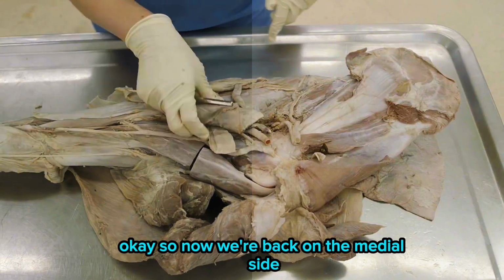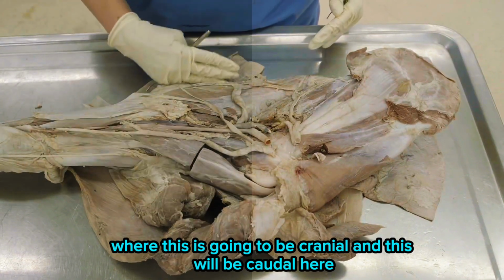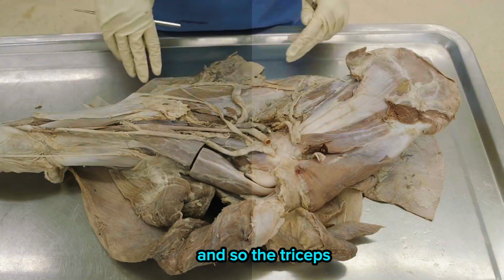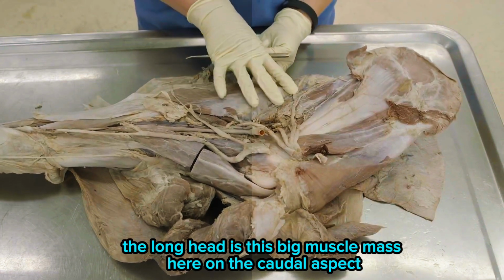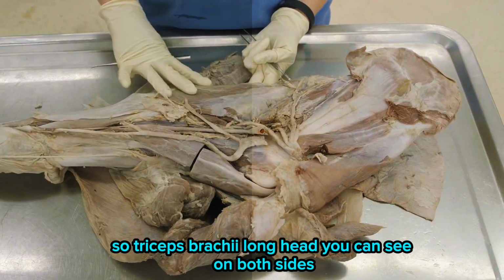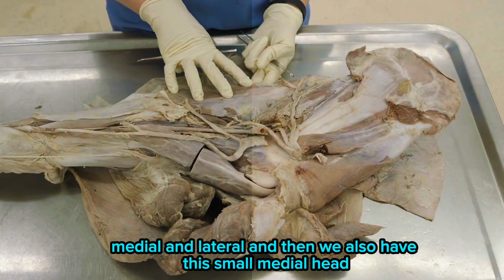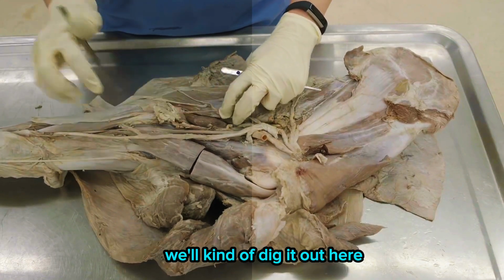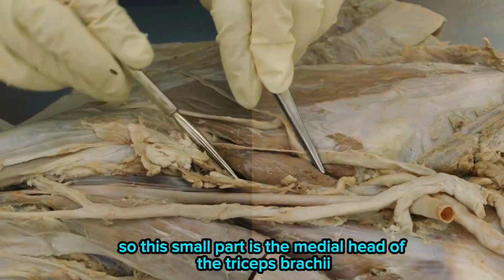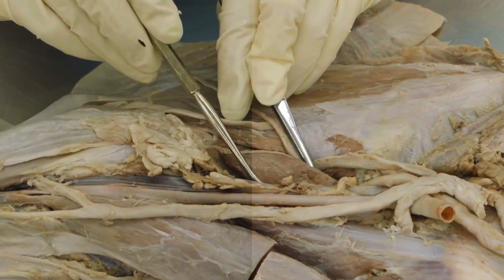Okay, so now we're back on the medial side where this is going to be cranial and this will be caudal here. And so the triceps, the long head is this big muscle mass here on the caudal aspect. So triceps brachii long head you can see on both sides, medial and lateral. And then we also have this small medial head. We'll kind of dig it out here. So this small part is the medial head of the triceps brachii.